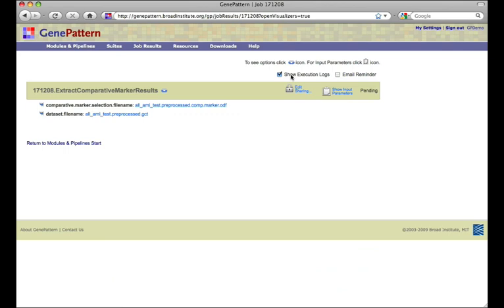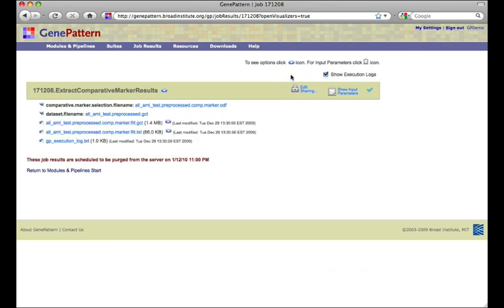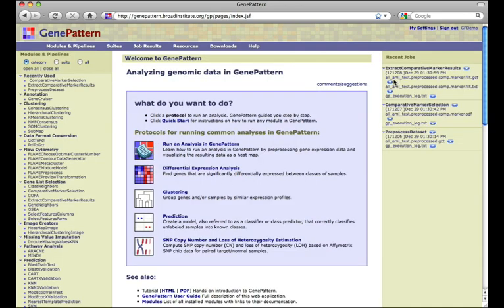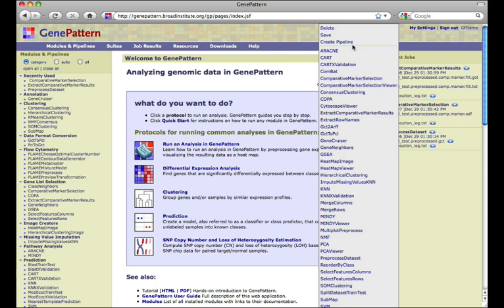Later on, we find that having a prepackaged workflow to run these three analysis steps would be very useful. So we locate the result file from extract comparative marker results, which was the final result of this series of analysis steps, and open the file menu from which we select Create Pipeline.